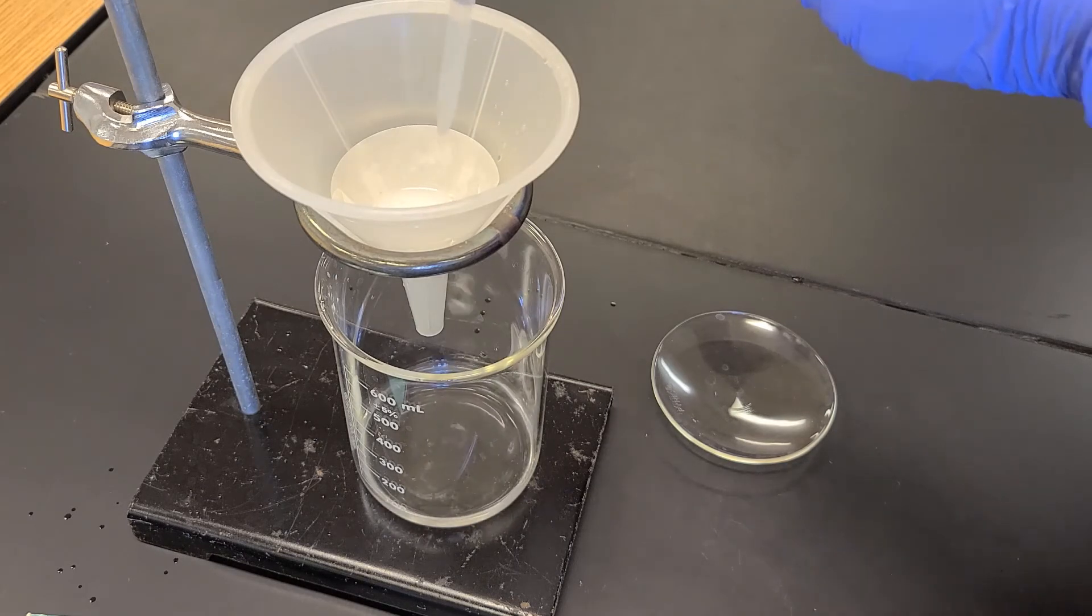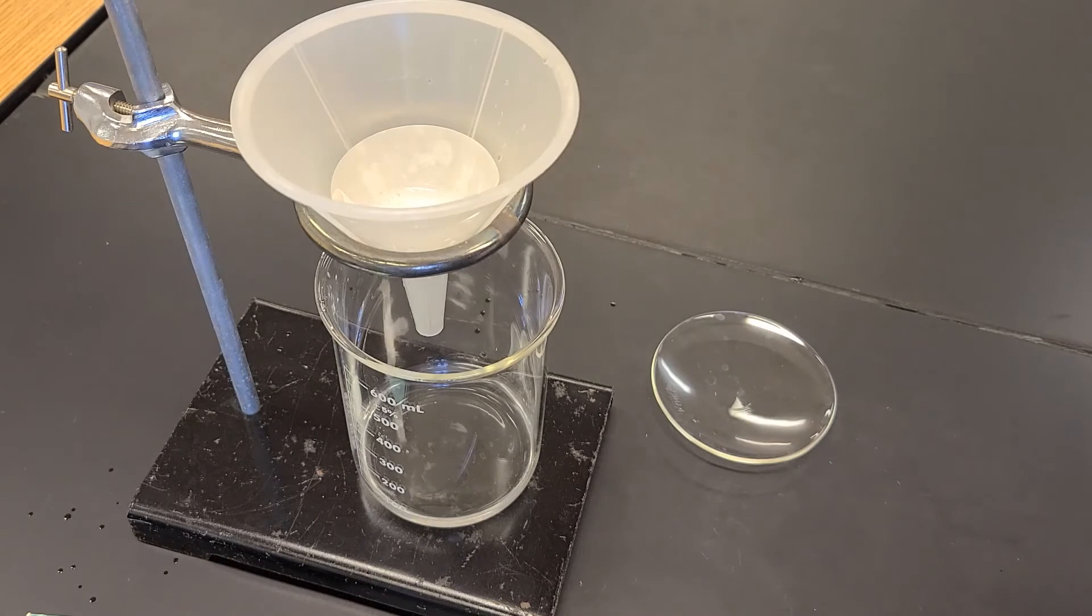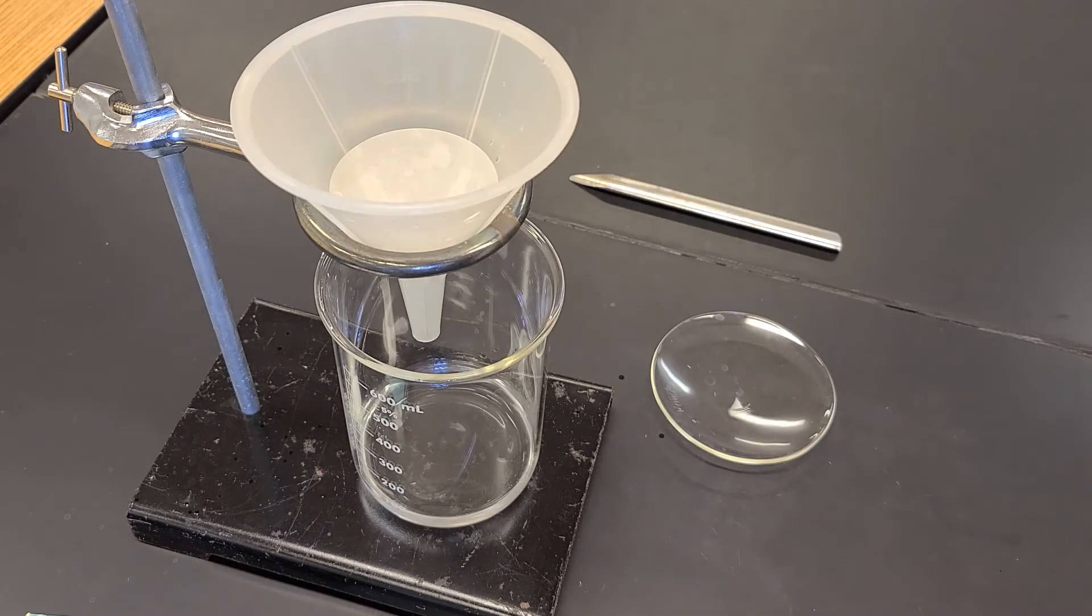It's also helpful to kind of wash all the precipitate down into the bottom of the filter paper, which makes it a little bit easier to take it out.